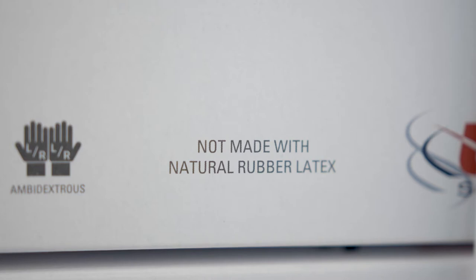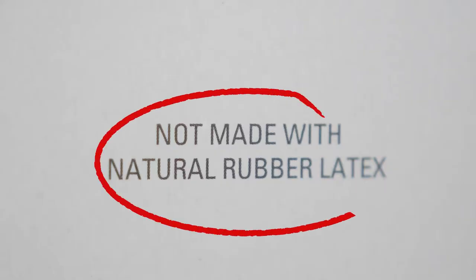For those who have latex allergies, please be aware that some gloves are made with latex. Make sure that you read the glove box to see if it says latex free or not — you definitely want to keep an eye on that.